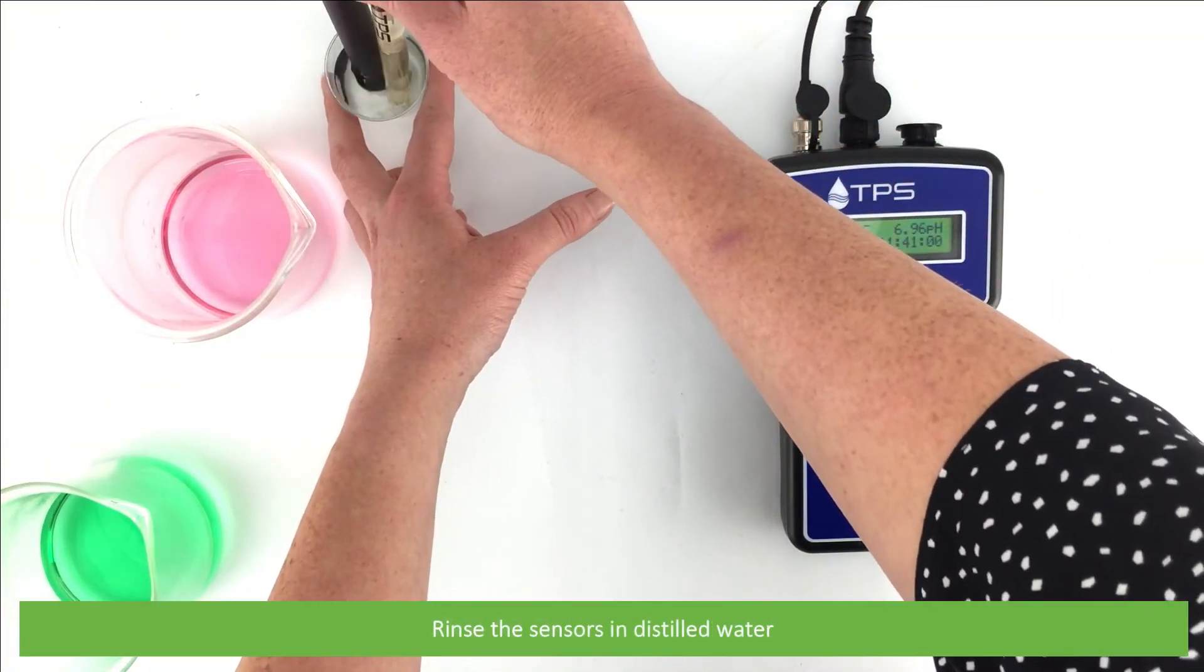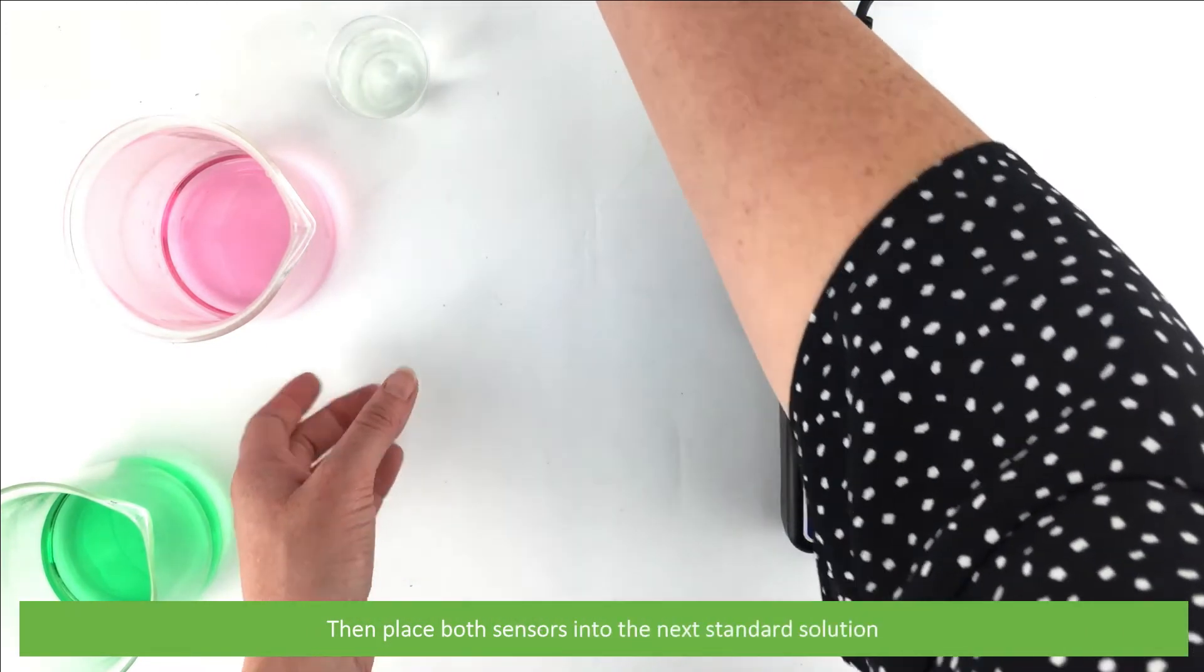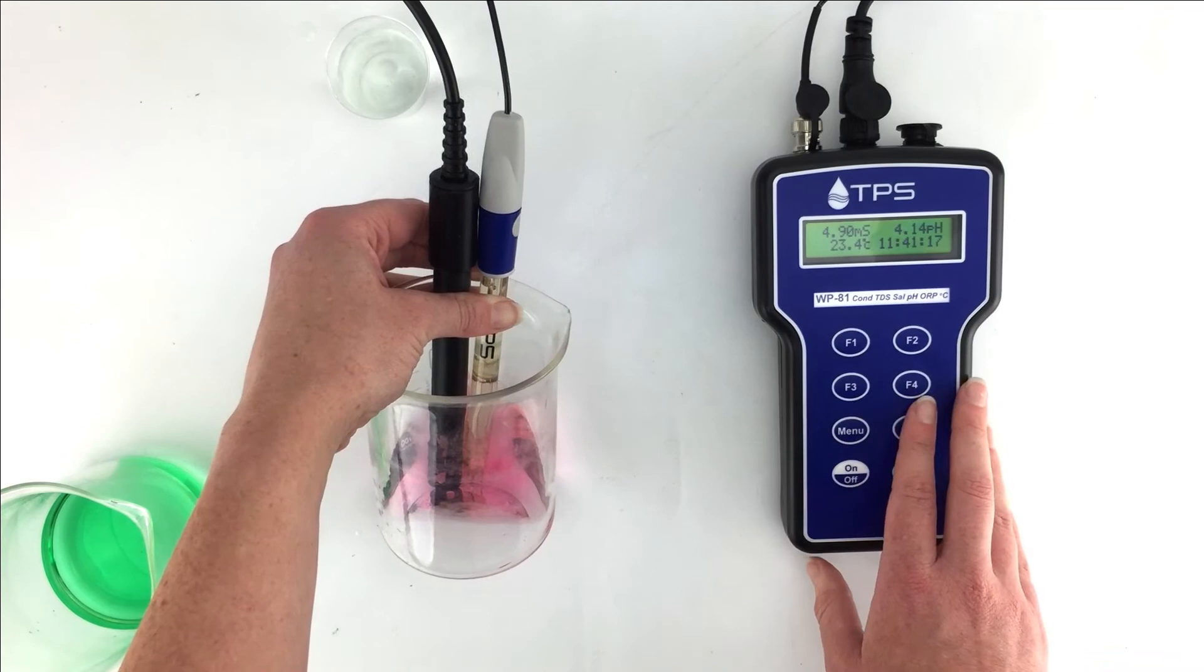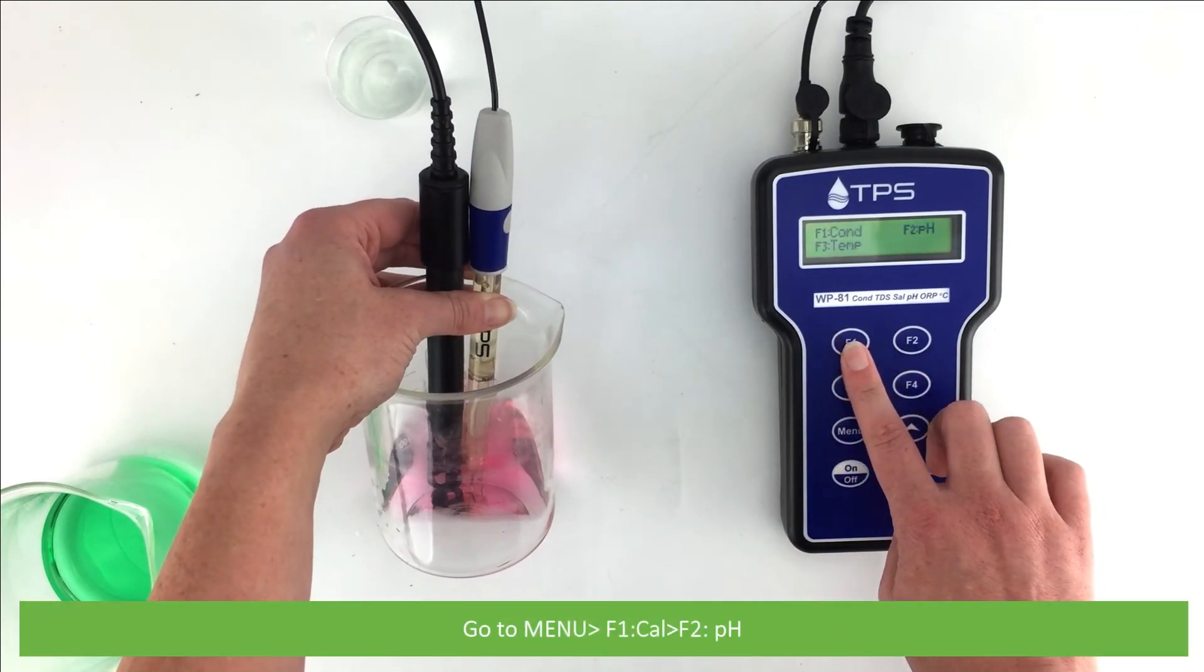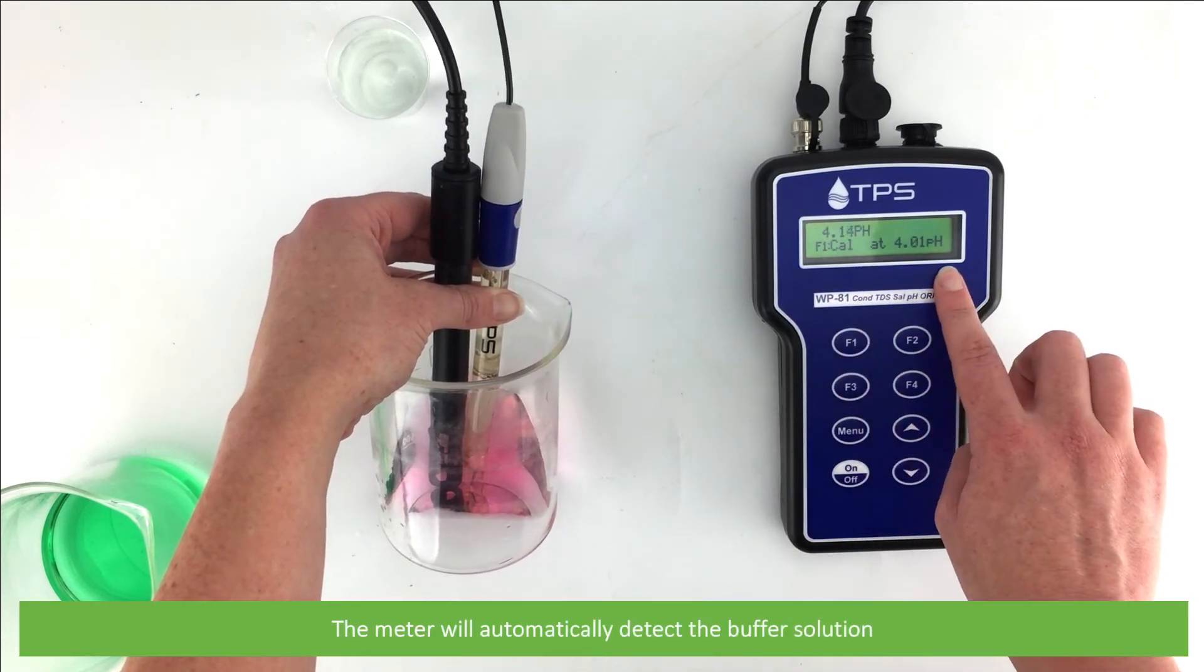Rinse the sensors in distilled water, then place both sensors into the next standard solution. Go to menu, F1 cal, F2 pH. The meter will automatically detect the buffer solution.